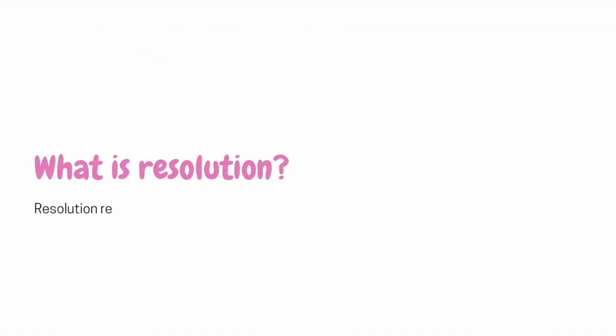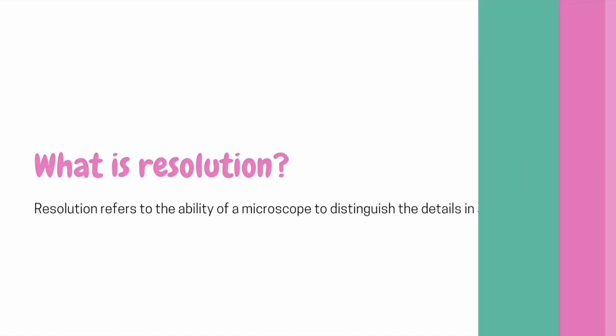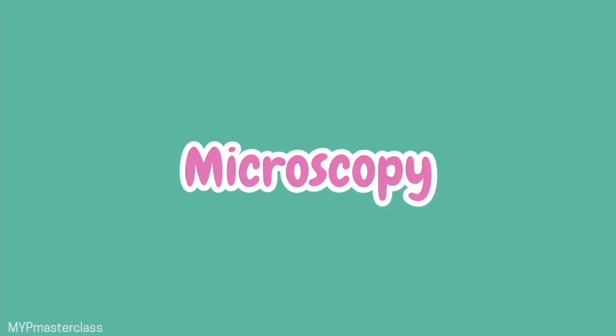On the other hand, resolution refers to the ability of a microscope to distinguish the details in a sample. For now, this is all you will need to know, but in the future you may have to do some calculations using these values.